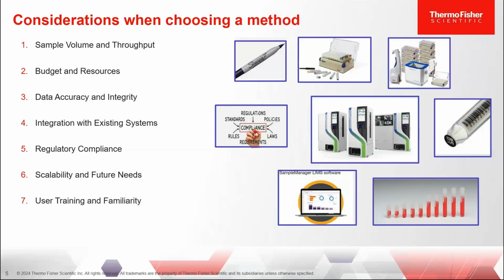Then integration with existing systems. Labs should consider whether their method can be seamlessly integrated into existing LIMS systems or any kind of sample management software that they're working with. This can actually streamline the workflow, enhance the traceability of the samples, and improve overall lab efficiency.